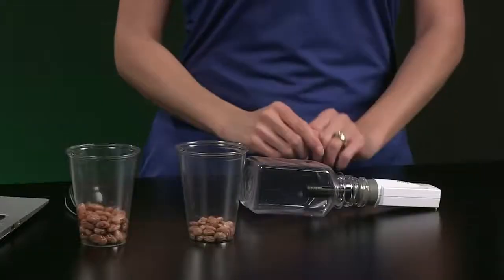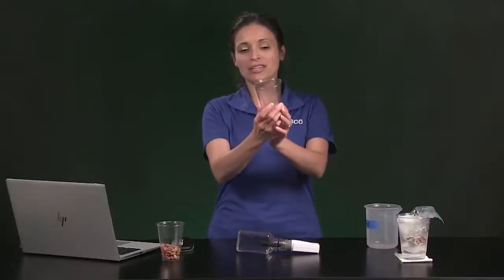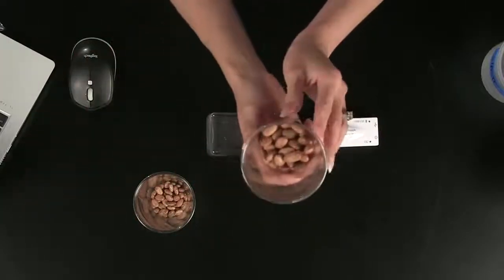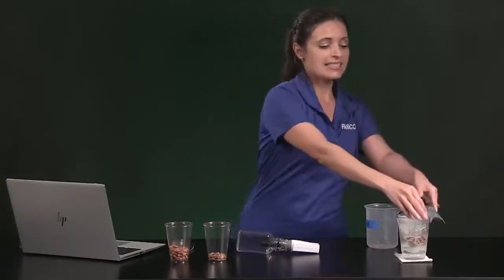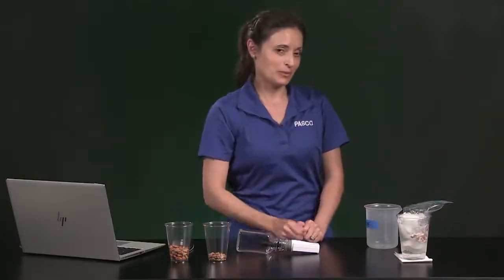I've already calibrated my carbon dioxide sensor. I have a sample of 50 dry or dormant seeds. They came out of a bag. This is 50 germinating seeds. I soaked these in tap water overnight. There's also 50 seeds in here, and these are at room temperature. I've got 50 seeds chilling in some ice water here. These are also germinating initially at room temperature, but now they're close to 0 degrees Celsius.